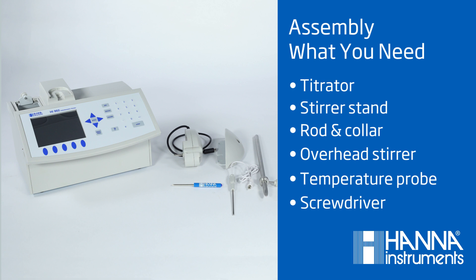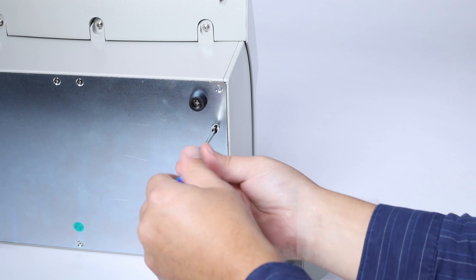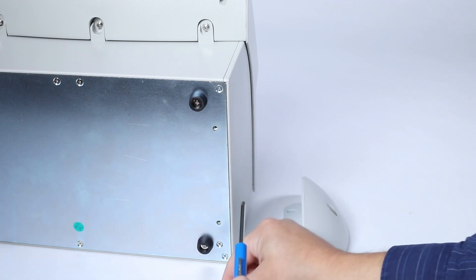Take your titrator and flip it over to attach the stirrer stand on the base. It can be placed on either side of the titrator. Remove the screws, place the stirrer stand into place, and refasten the screws.